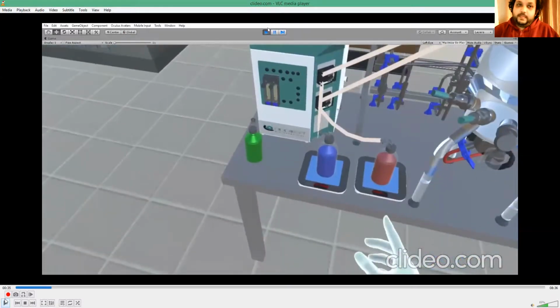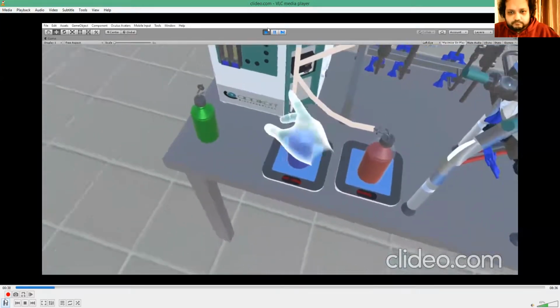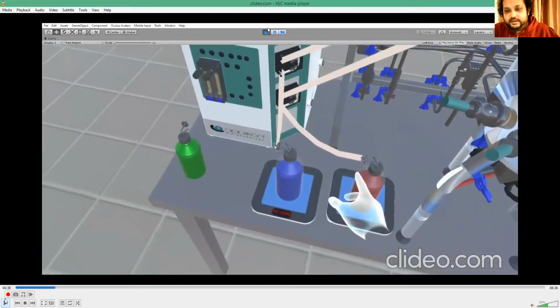And there is another form of simulation, which is the desktop-based simulation, and those simulations are mainly used for heavy calculation-based simulation work. Now, what we try to achieve here is to merge these two paradigms into a singular package.